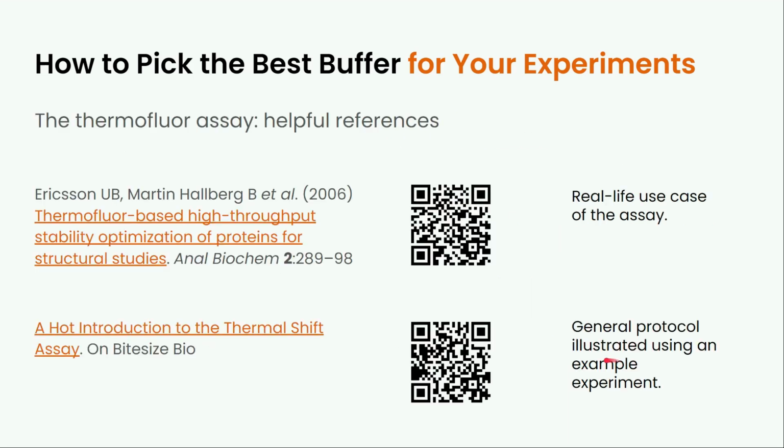So if you want to dive into this a bit deeper, you can follow these references. This will take you to a paper where people have used this assay for structural studies, so purifying proteins for X-ray crystallography. They talk you through how to do it, and then I've written a short article on Bite Size Bio that talks you through this assay and gives you a general protocol that you can adopt for your experiments, and you can use it to screen whether or not your target molecules are happy or unhappy in the presence of certain buffers and at different pHs.